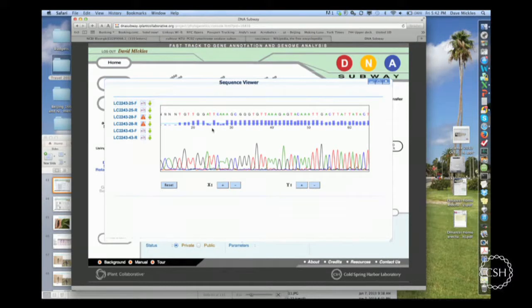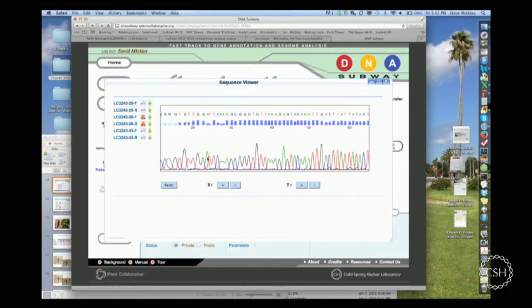So a quality score of 10 is 10 to the first power, or 1 sequence error per 10 nucleotides. So it means that when you're looking at this sequence here, which looks to be about a 10 score, it means it's a 1 chance in 10 that this is an incorrect call. And in fact, see how this is crammed next to the peak next to it? This probably is a bad call.